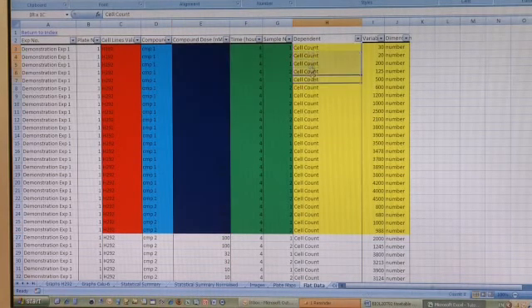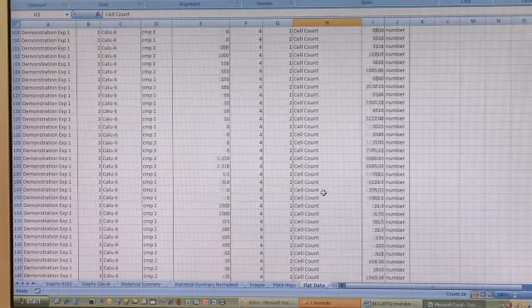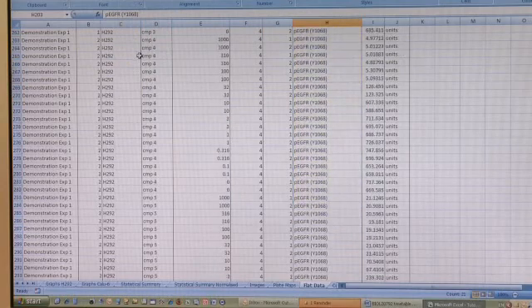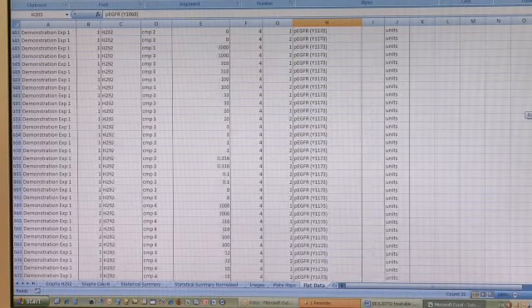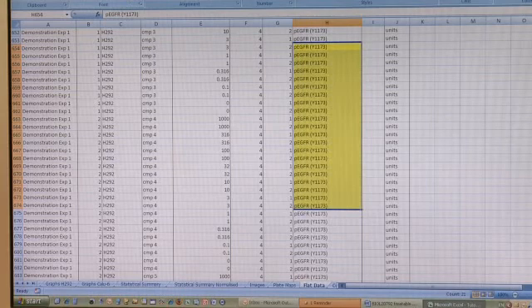So the measured variable cell count is in the first row, and if we scroll down, we begin the second measured variable, which is phospho-EGFR, shown here. If we scroll down, we come to the third measured variable, which is phospho-EGFR, different tyrosine site, shown here.